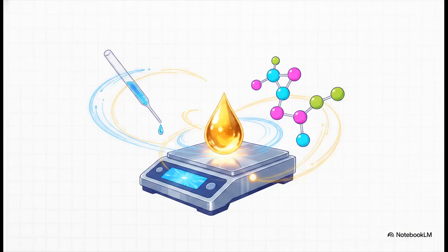We've finished the wet lab work, recorded our burette readings, and cleaned up the bench. Let's transition over to the calculator. And hey, don't let the math overwhelm you. It perfectly mirrors that $100 bill analogy we just talked about. To find the saponification value, we take the volume of acid used for the blank, our $100 bill, and we subtract the volume used for our sample, our change.